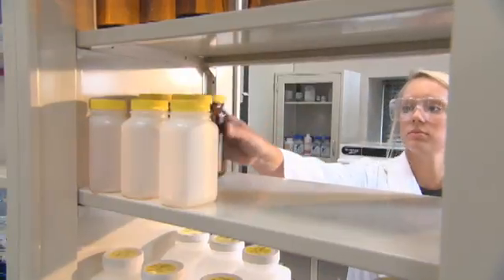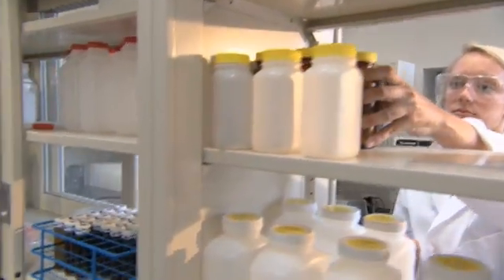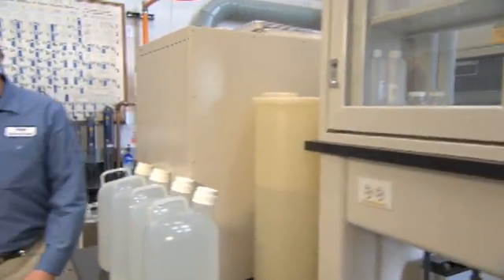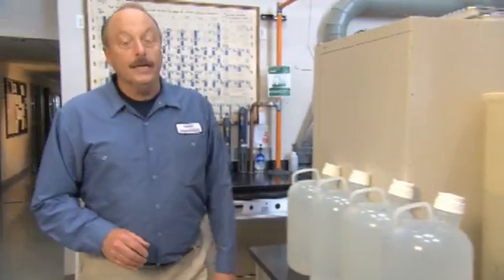There are more than 500,000 workers employed in laboratories in the U.S., including those in water utilities. What they all have in common is the potential exposure to chemical, biological, physical, and radioactive hazards. Lab safety is governed by numerous local, state, and federal regulations. But good safety procedures are primarily the responsibility of those of us working in these labs.